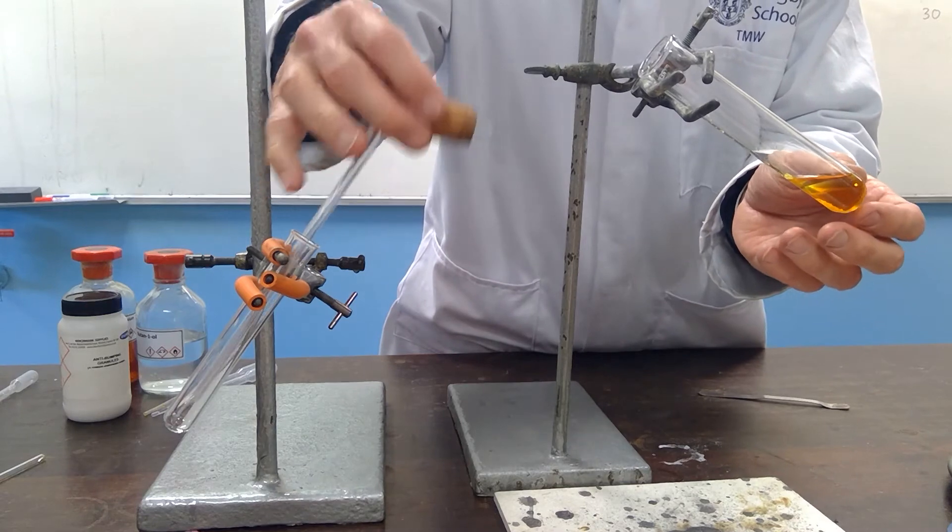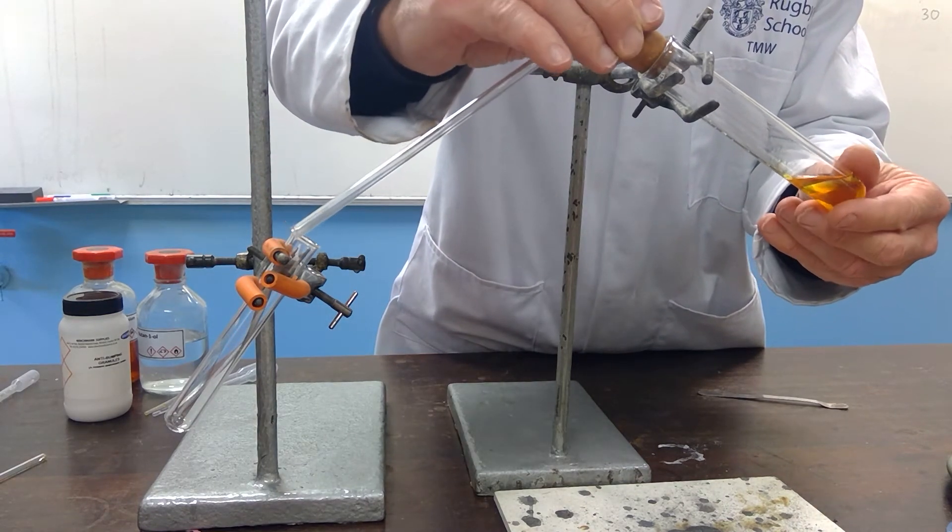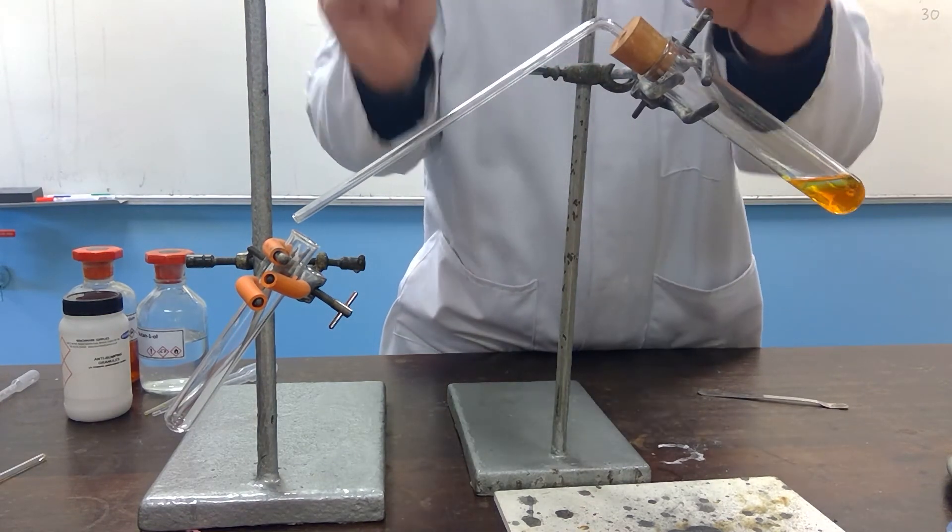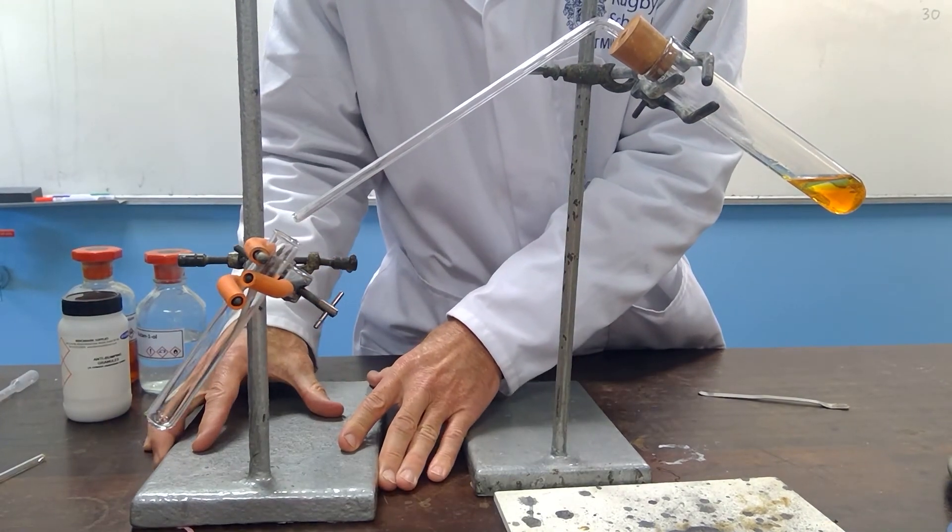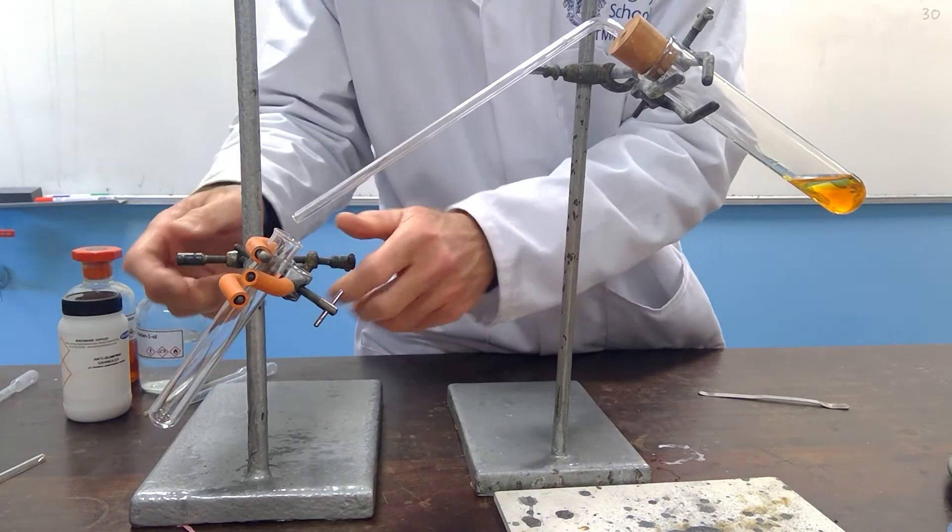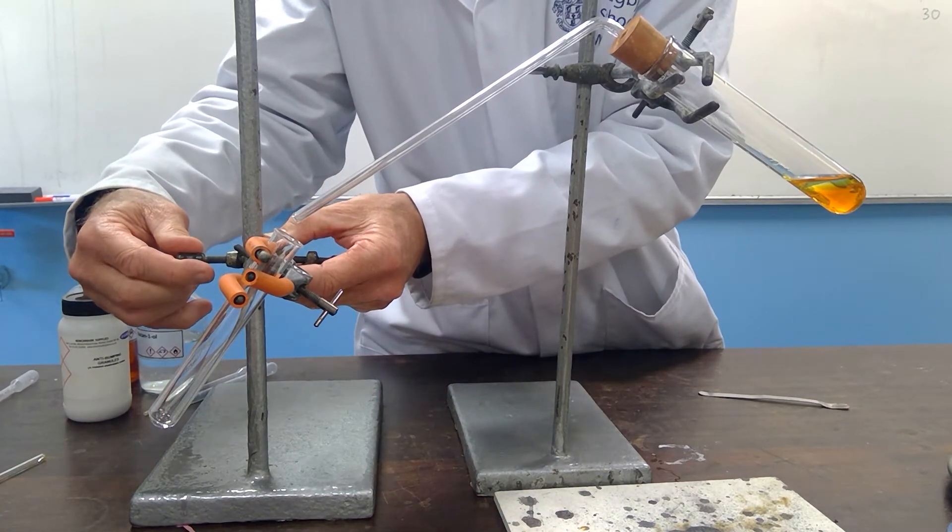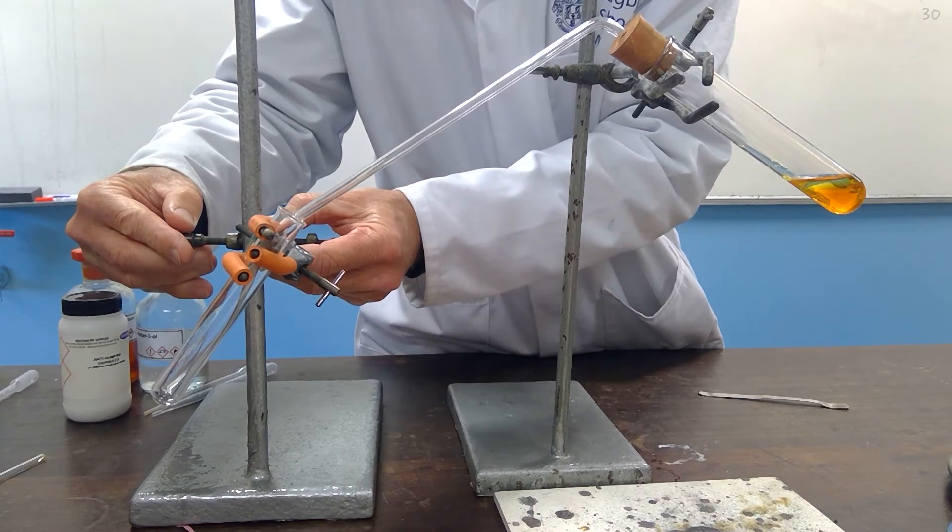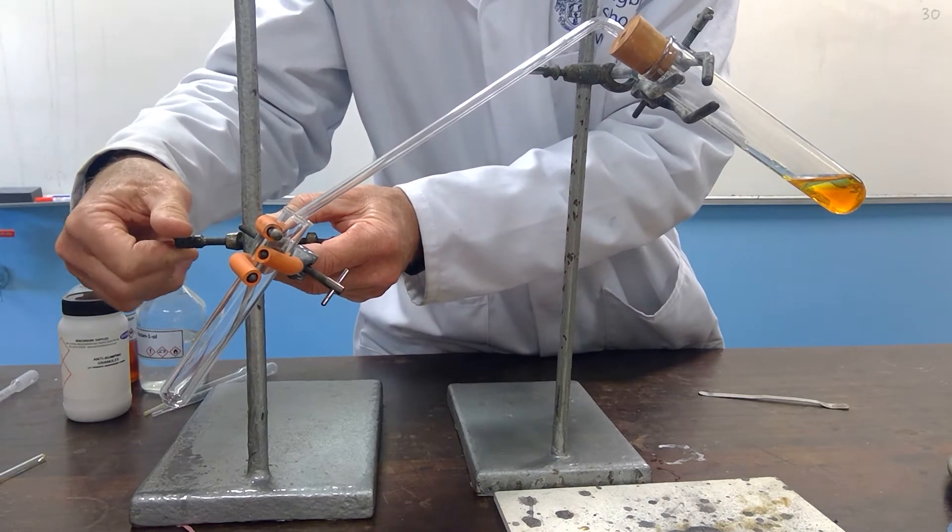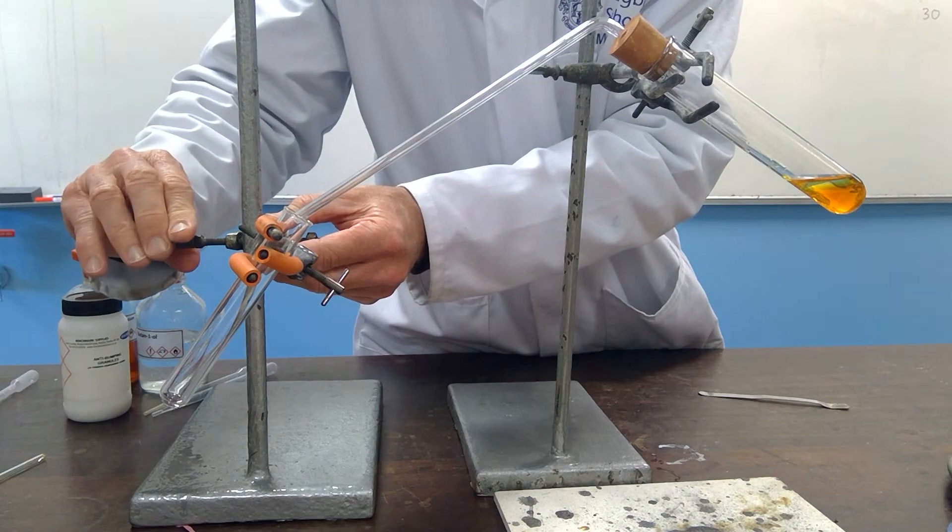Okay, so all that we need to do is to heat the combination and bring over the products. Now, in the case of butan-1-ol, the product is going to be butanal. This distills over because it has a lower boiling point than the butan-1-ol and also a lower boiling point than the potential product of butanoic acid.